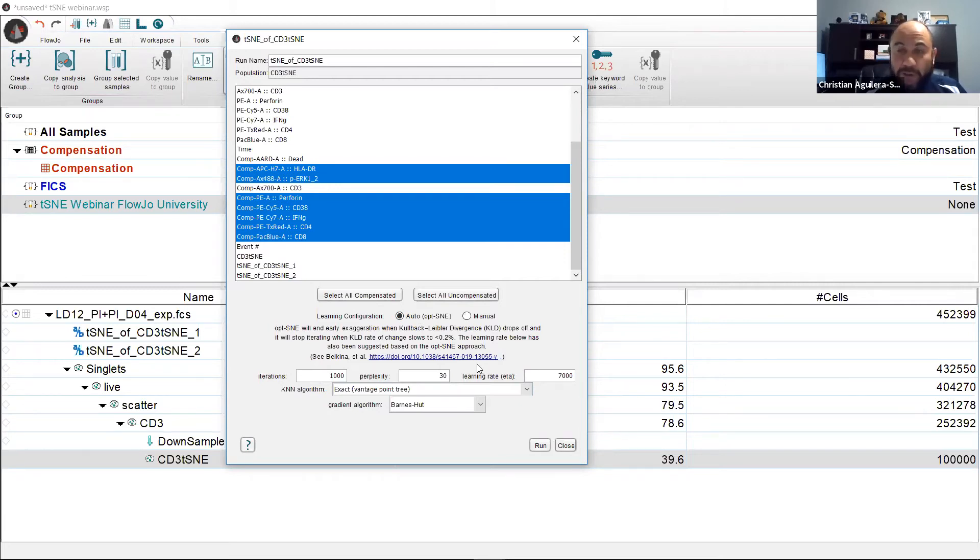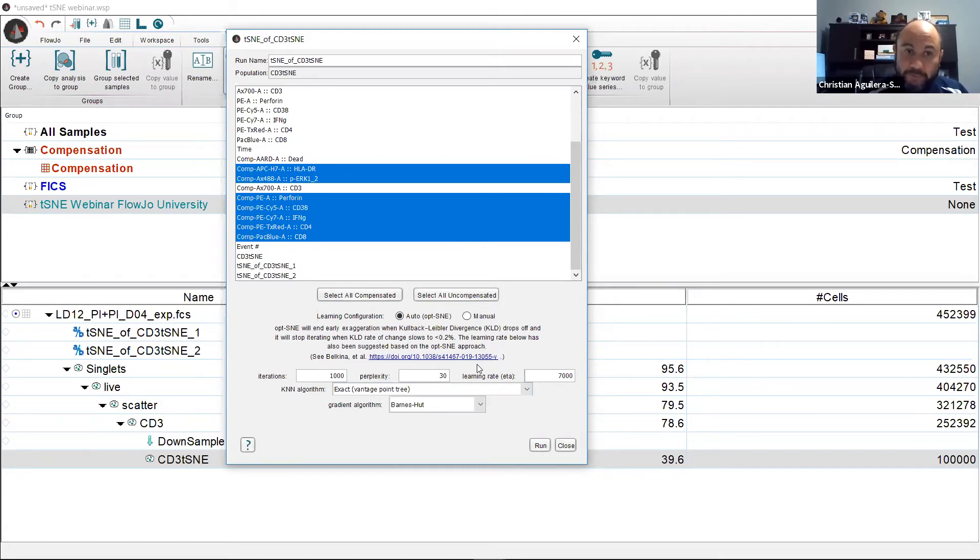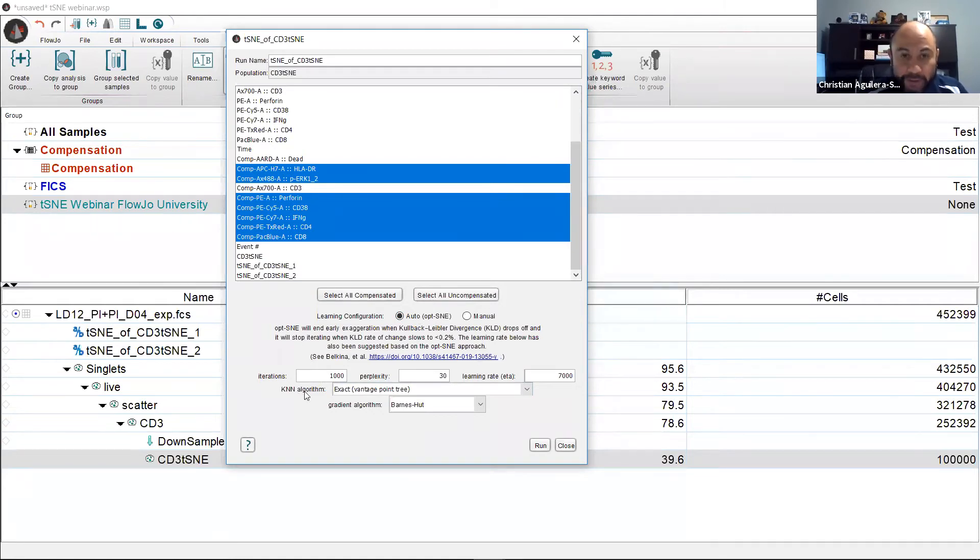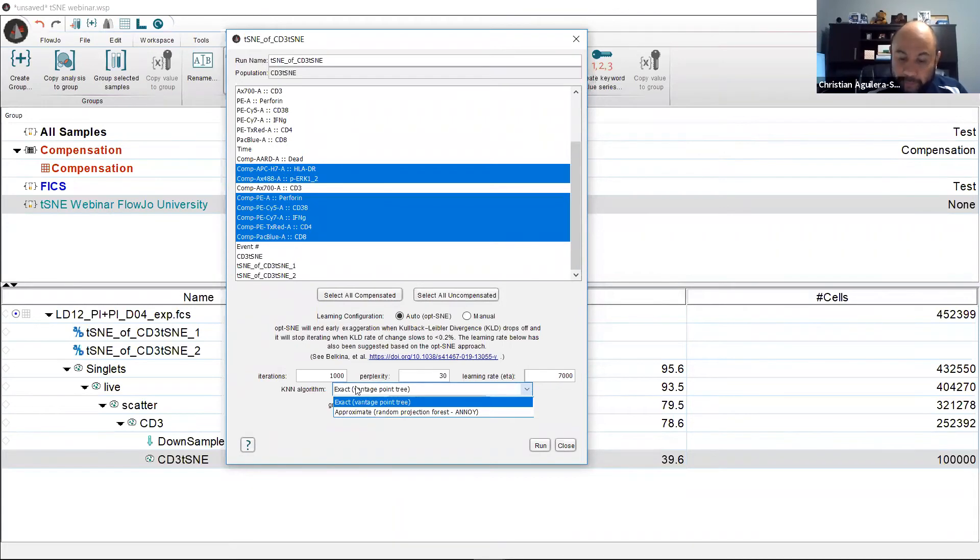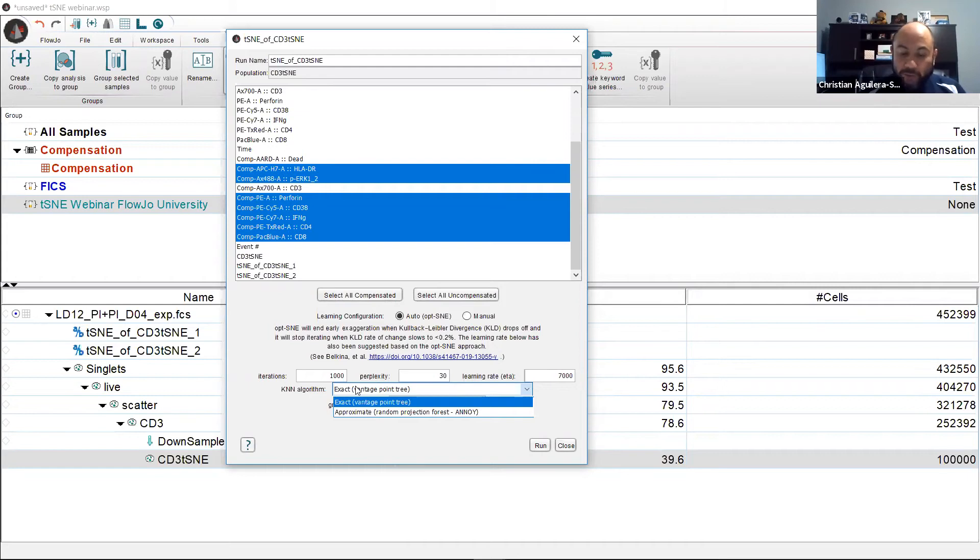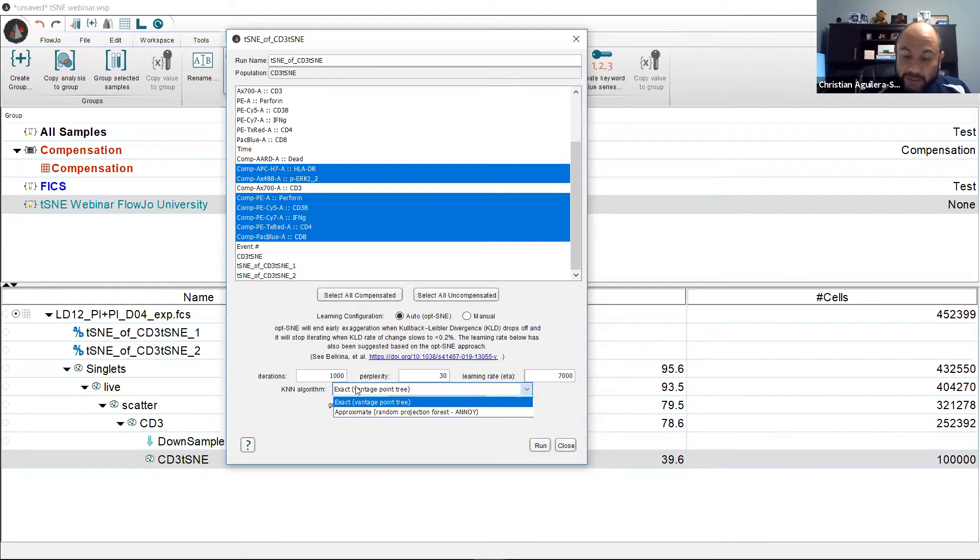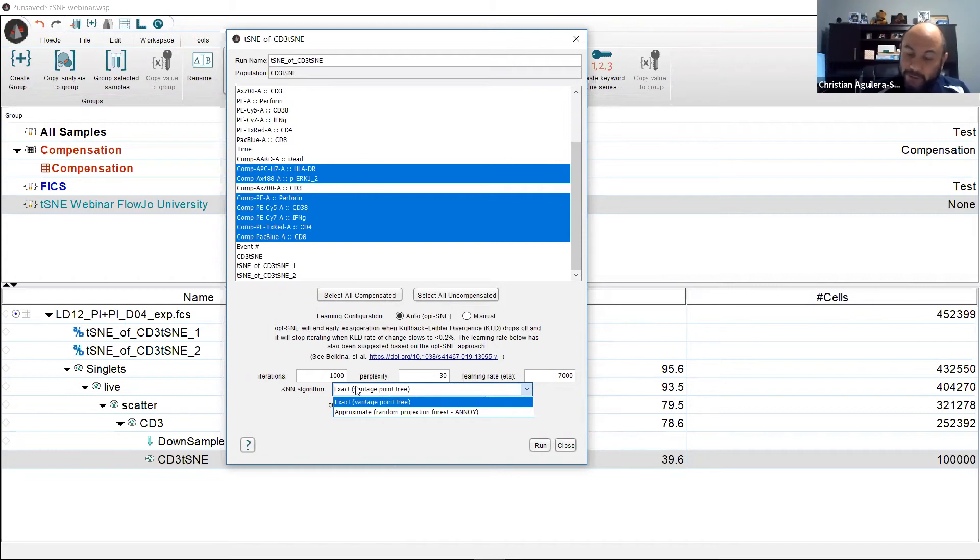However, there are two choices that need to be made and those are regarding the algorithms that you wish to run your t-SNE on. First, let's visit the KNN algorithm. This one is composed of the exact and approximate annoying. And this is exactly how it sounds. You either want to run an exact or approximate measurement of the distance of neighboring cells. Exact takes longer to run as you would expect. However, t-SNE plots of 5 million events or less are very similar between the two algorithms.